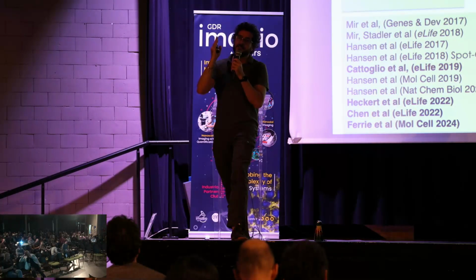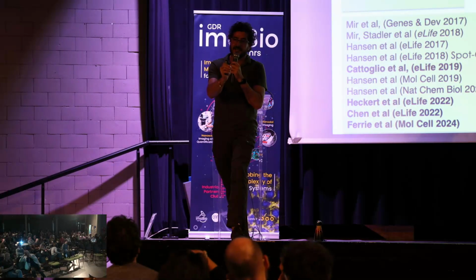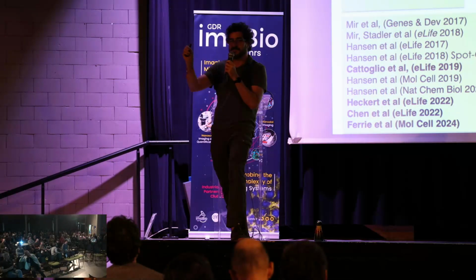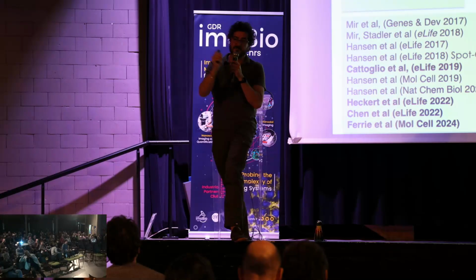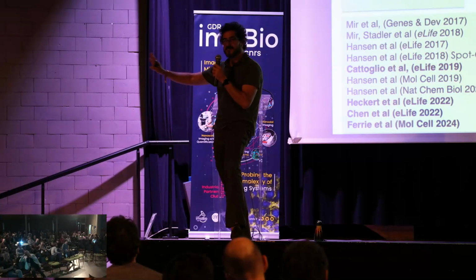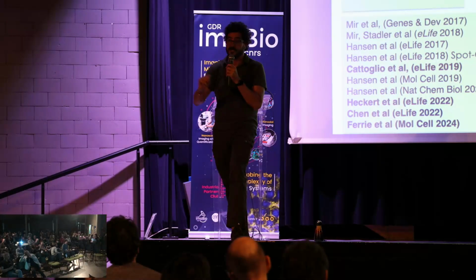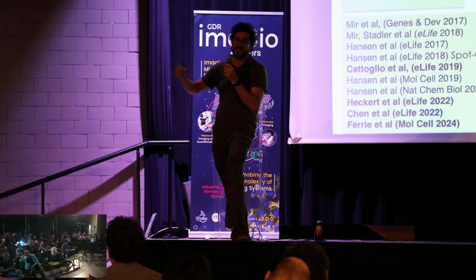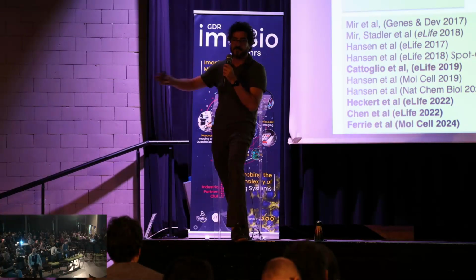Here, you photoconvert a dye with a green light, and it's only going to become fluorescent in red as a function of the proximity of another protein at the time of photoconversion. Once it's photoconverted, it's a full dye. It's going to live its life whether your molecule stays or not, actually. But it's going to stay fluorescent, and now I can image it as a single molecule and follow its life.